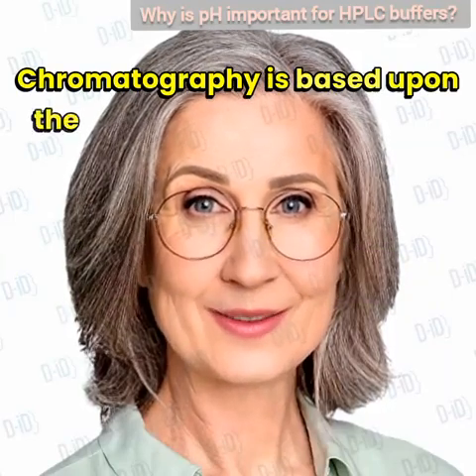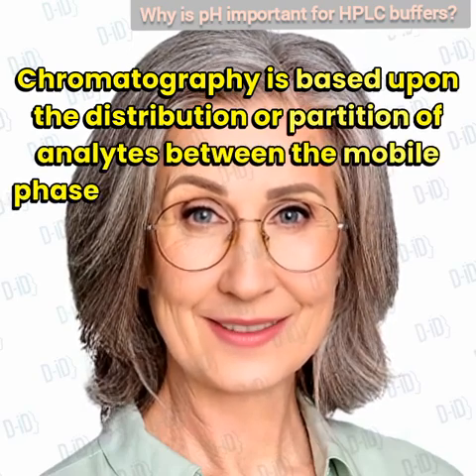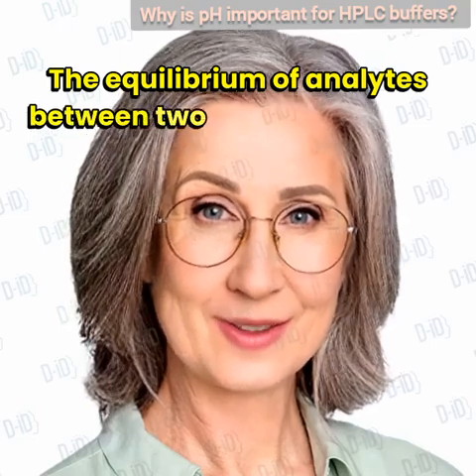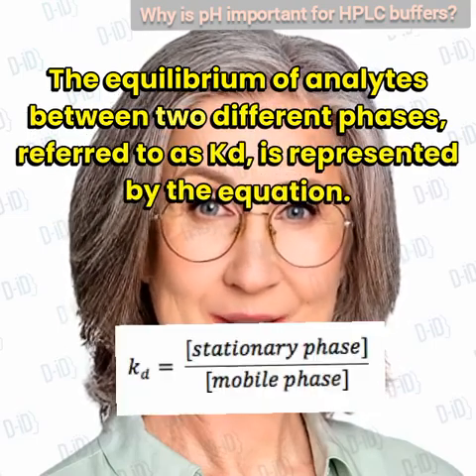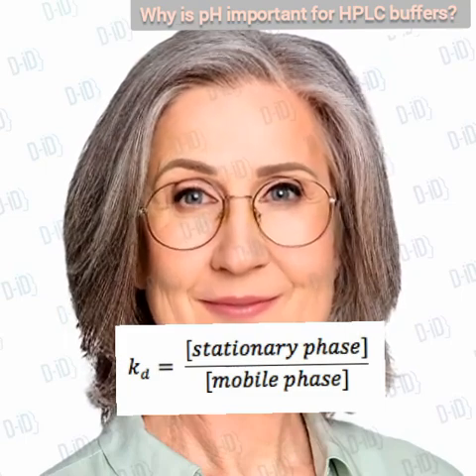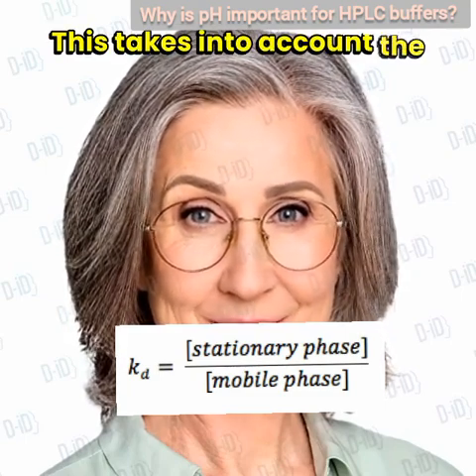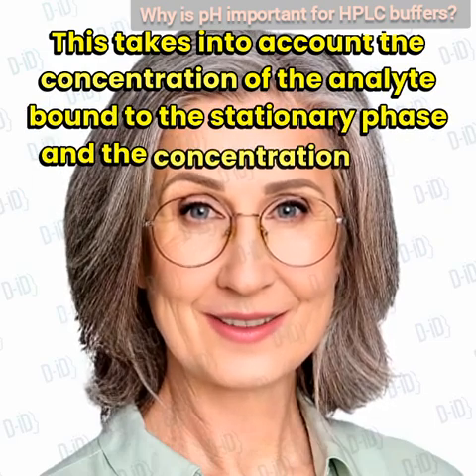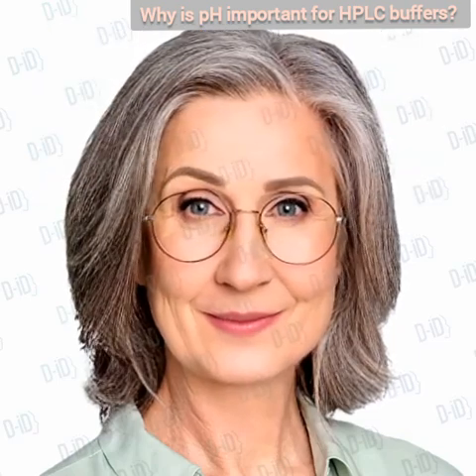Chromatography is based upon the distribution, or partition, of analytes between the mobile phase and the stationary phase. The equilibrium of analytes between two different phases, referred to as Kd, is represented by the equation. This takes into account the concentration of the analyte bound to the stationary phase, and the concentration of the same analyte traveling in the mobile phase.